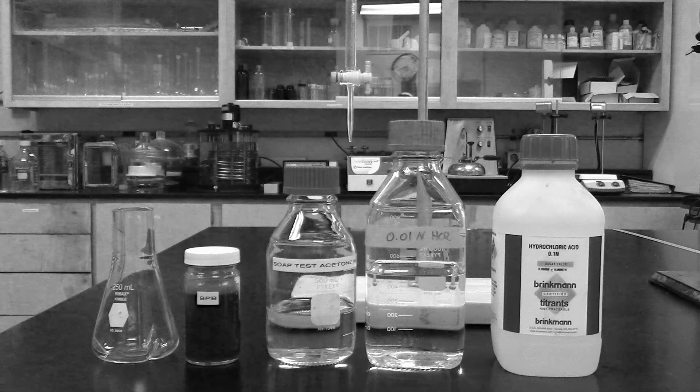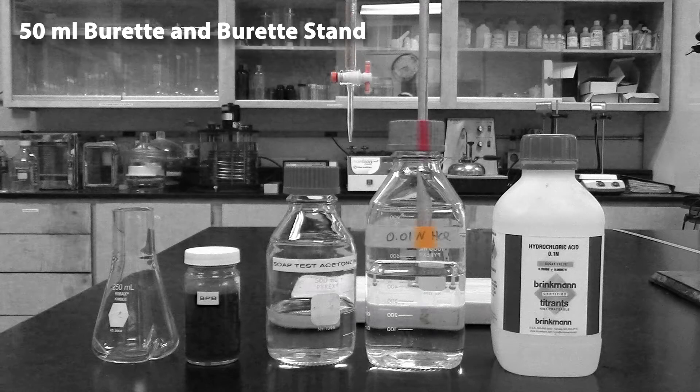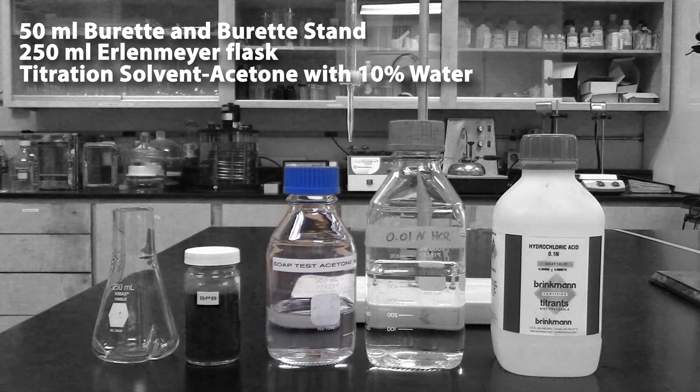The apparatus needed will be one 50 milliliter burette and burette stand, a 250 milliliter Erlenmeyer flask. The reagents you'll need: titration solvent, which is acetone containing 10% water, and a titrant which is hydrochloric acid in 0.1 normal or 0.01 normal.